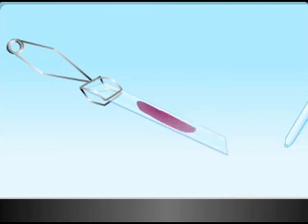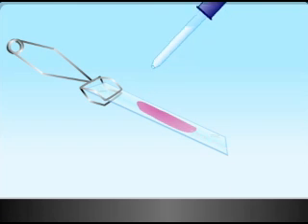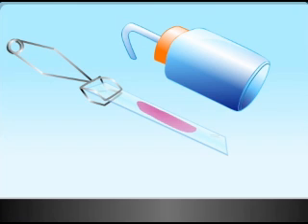The cells are then decolorized by washing with ethanol or acetone. This is the differential step. Gram-positive bacteria retain the crystal violet, whereas gram-negative bacteria do not. The ethanol or acetone should be added drop-wise, with the slide tilted at an angle, until the drop coming off the edge of the slide just starts to become colorless. Even gram-positive cells can lose the crystal violet-iodine complex during prolonged, excessive decolorization.